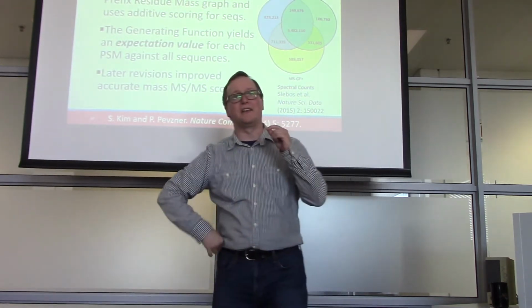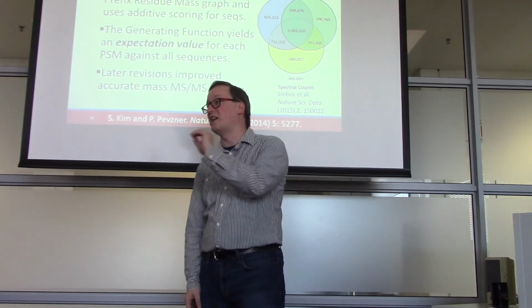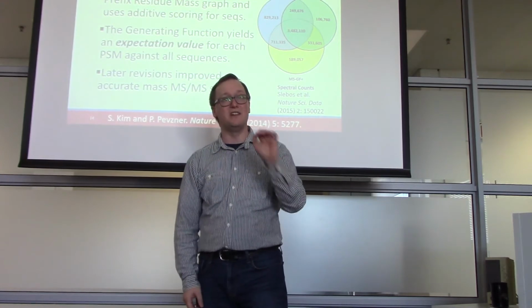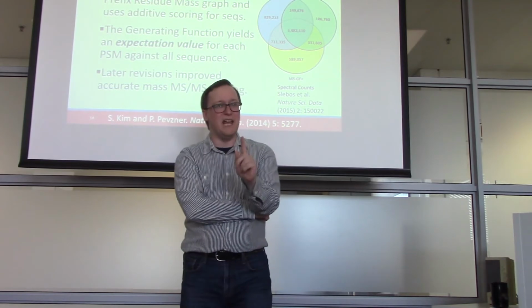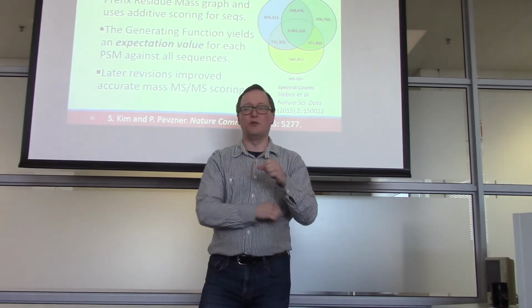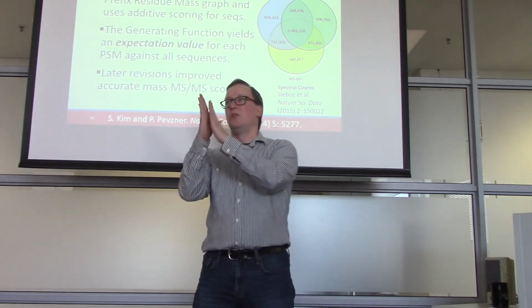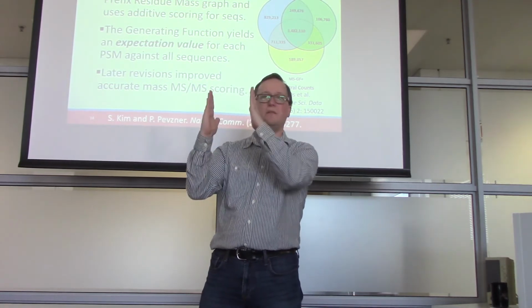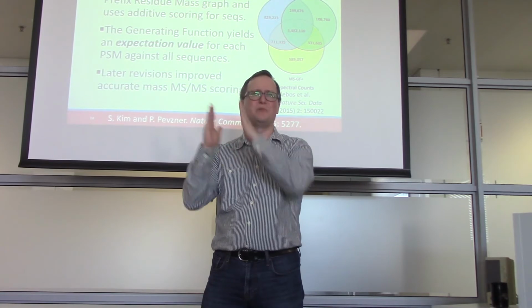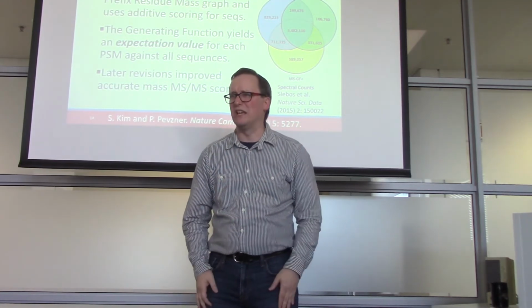Let's start by the fact that MSGF Plus is not like other database search engines in that it does not score against the spectrum as it is. Instead, they transform the spectra in a way that tries to say, what is the probability that there was a breakage in this peptide in mass units from the N-terminal end? Isn't that squirrely?